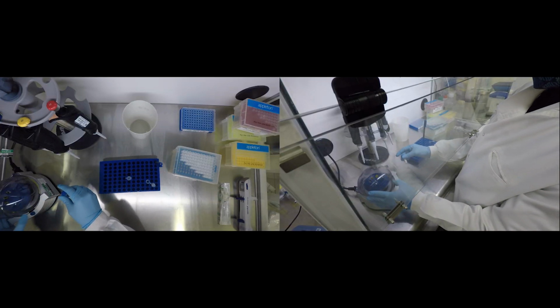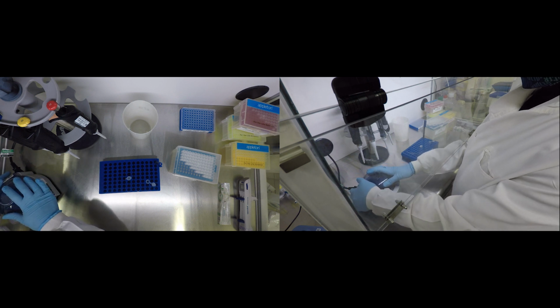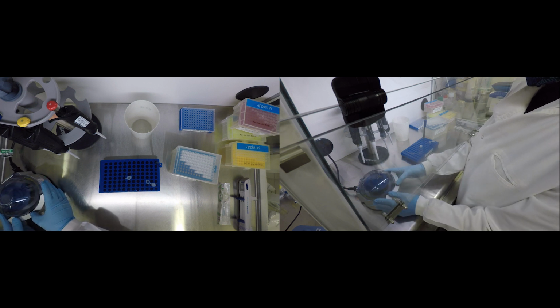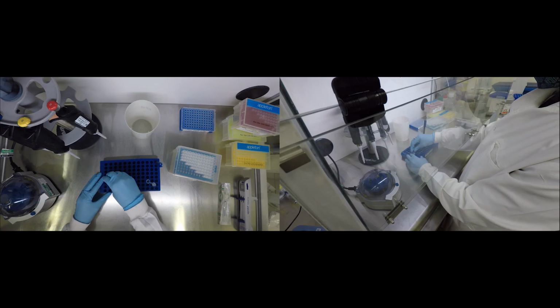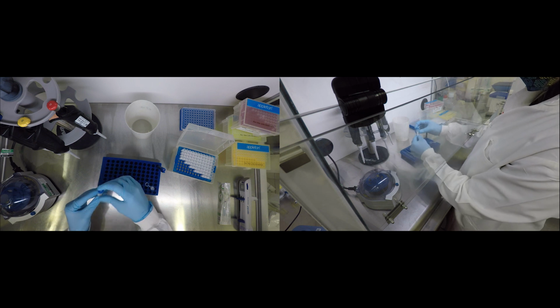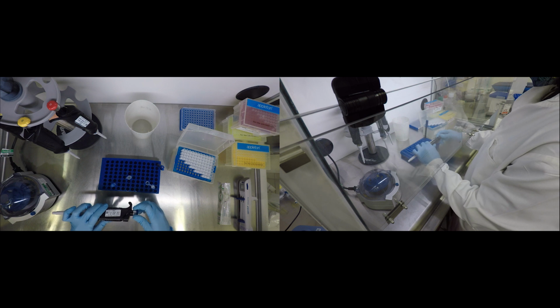This clip is for unresuspended oligos and how to bring the oligos into your working concentration. First, spin down the lyophilized tubes. Then take the number showing you the yield in nanomole and multiply it by 10 to add the required volume of 0.1 XTE to bring the primer or the probe at a concentration of 100 micromolar. This will be your most concentrated stock.